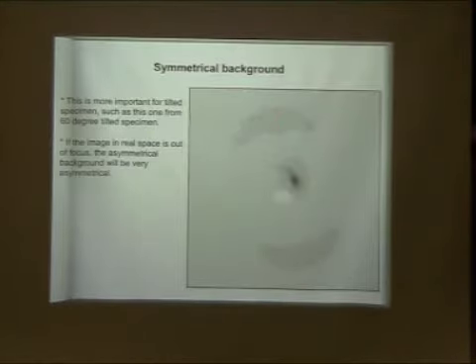But if your image is really out of focus, you will get something really weird. I actually don't have an example to show you, because when we see images like this, we never process them. That's why focusing is actually important, and why there are a number of things you need to consider when you do the diffraction.